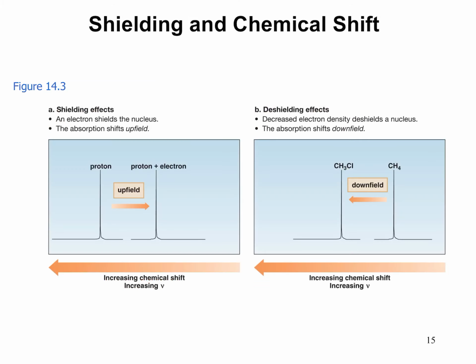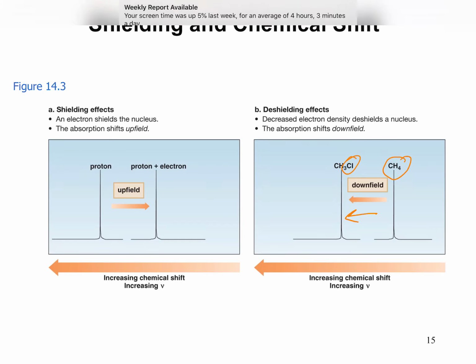All right. And that's what we can see here, right? So imagine we have a methane group right here, but if we take one of those hydrogens and we replace it with a chlorine, then what we see here is that it starts to be more de-shielded, right? It starts to go more downfield, closer to 14. So we want to keep those aspects in mind there.